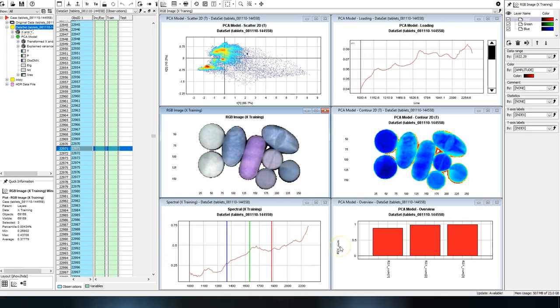If you want to look at some data in the form of a table or plot, simply drag and drop it from the data tree.